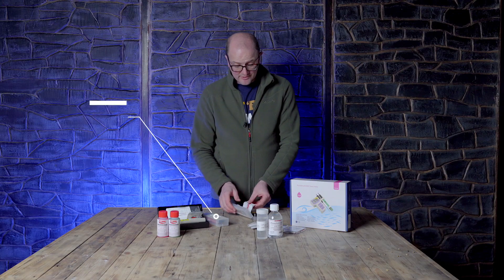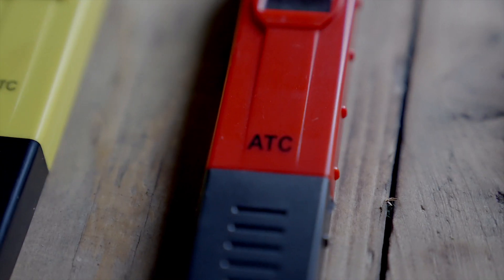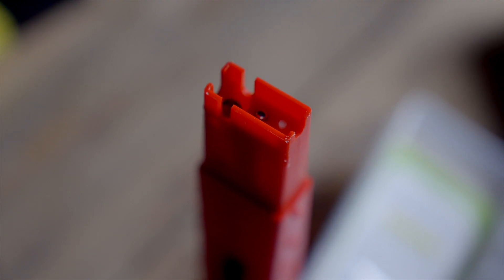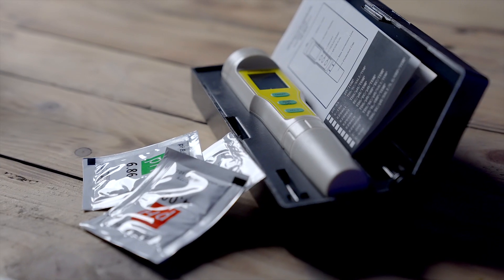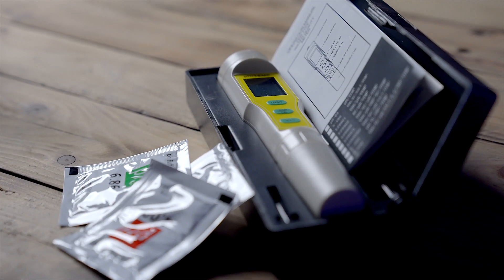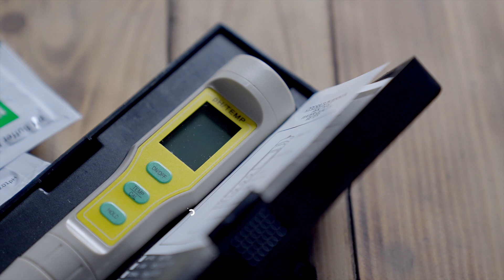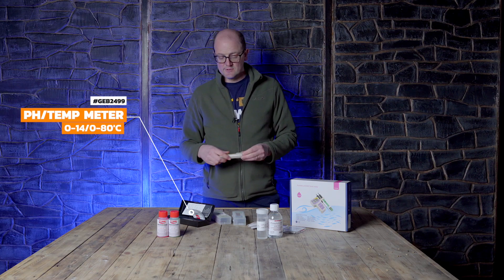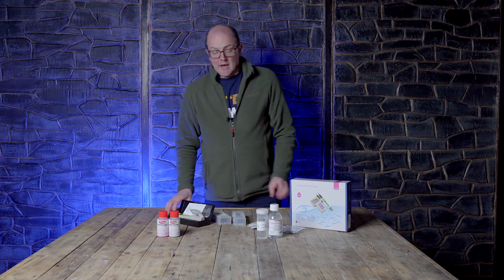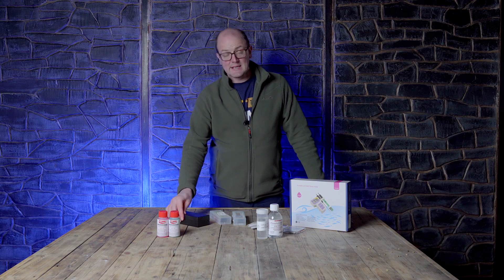You use a 4.01 and a 6.86 pH buffer solution to calibrate. We have two versions of the basic pen — one standard and one with a backlight, so you can see it in low light areas. We also have a third pH meter that includes a temperature reading at the same time. It's very simple, with batteries in the top and an electrode in the bottom. All of our pH meters come with batteries included and come pre-calibrated, so you don't need to calibrate them for first use.